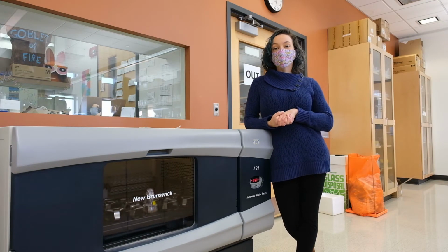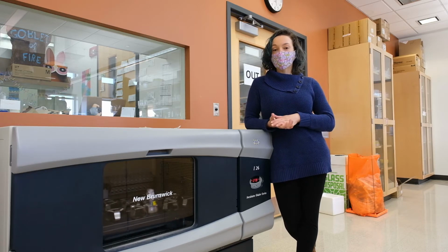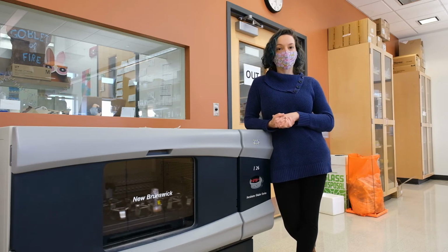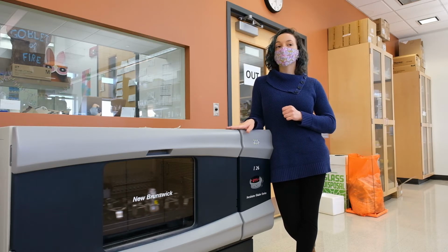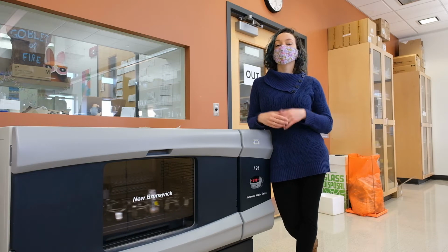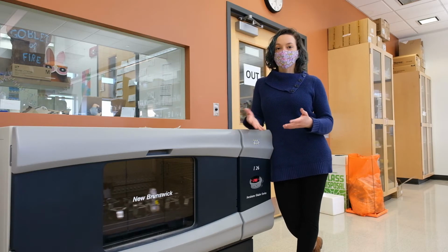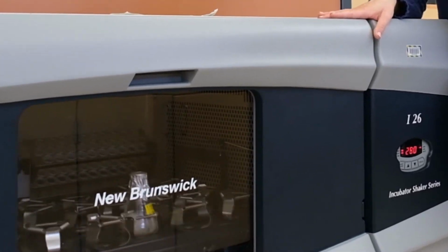We get a lot of questions about how to collect metabolomic samples, so today we're going to talk about one aspect of collecting really good metabolomic data, which is to do the metabolite extractions while your cultures are in their growth conditions that you're testing, or as close as possible to that scenario. So here we have some bacteria growing for an experiment. Let's take a minute to zoom in on these.